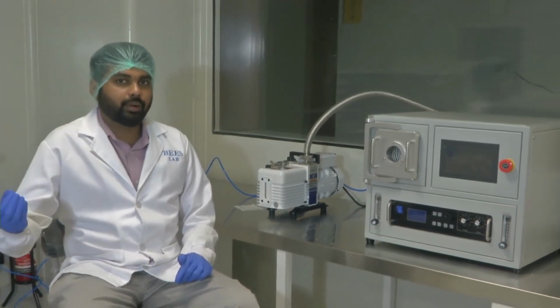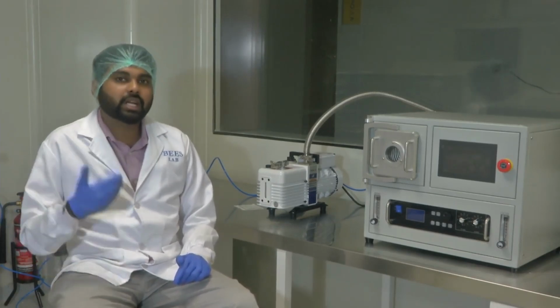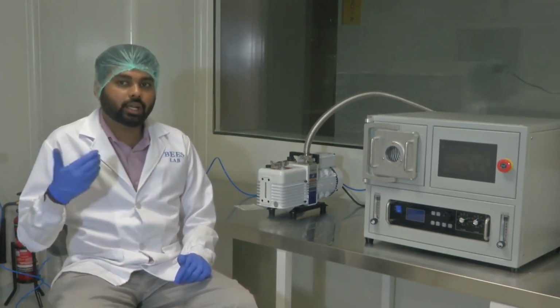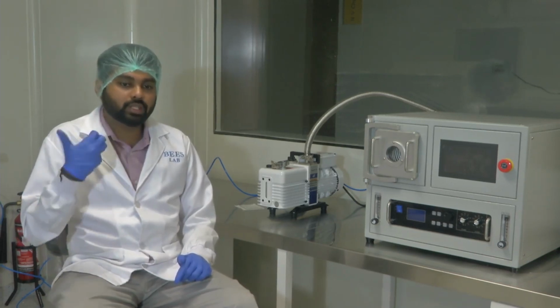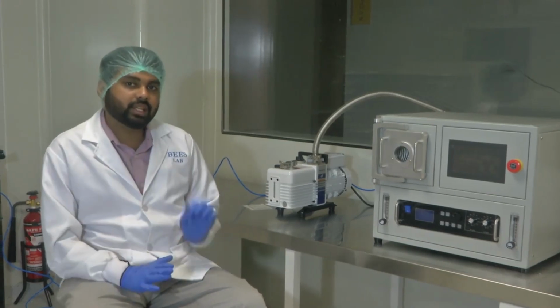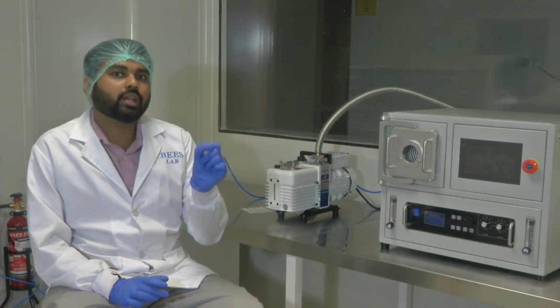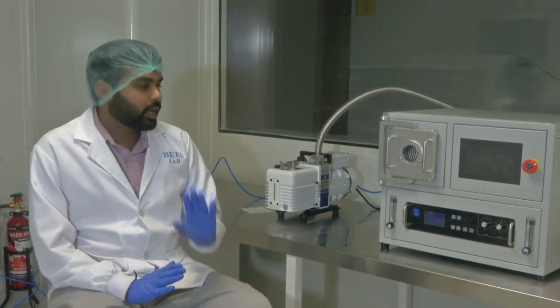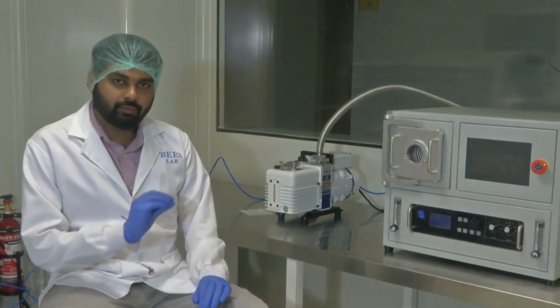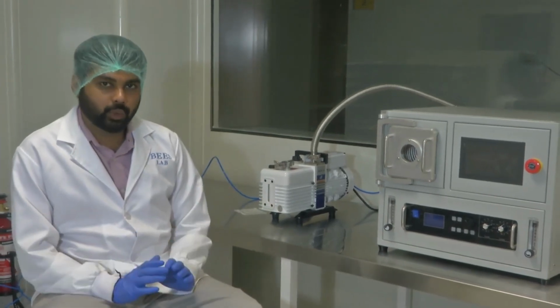So it is controllable. Especially in such systems, the robustness is measured by how well you can control the system, how much of the control of the system is in your hands. So that is why the system is designed in such a way that you can exactly tune it to perform in the way you want it to perform. Okay, so we have a chamber, we create vacuum inside it, then we let in oxygen into it.